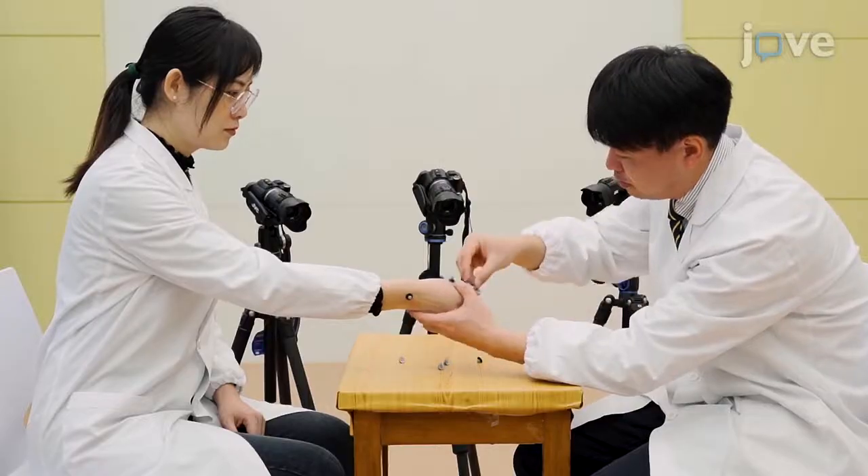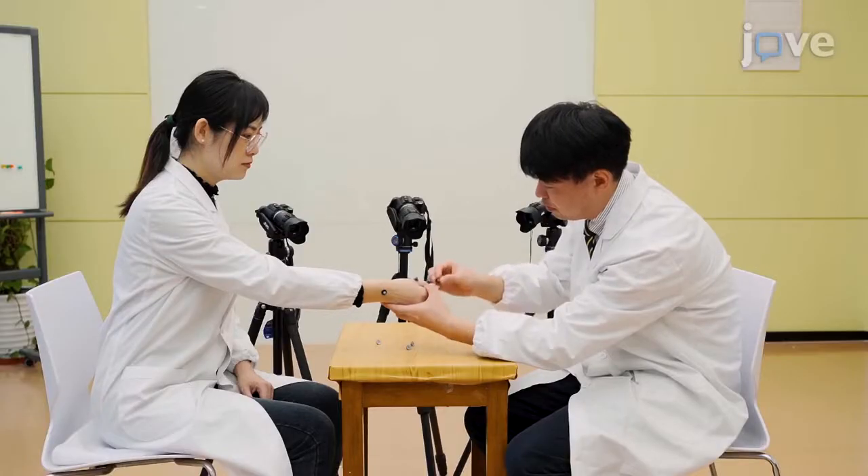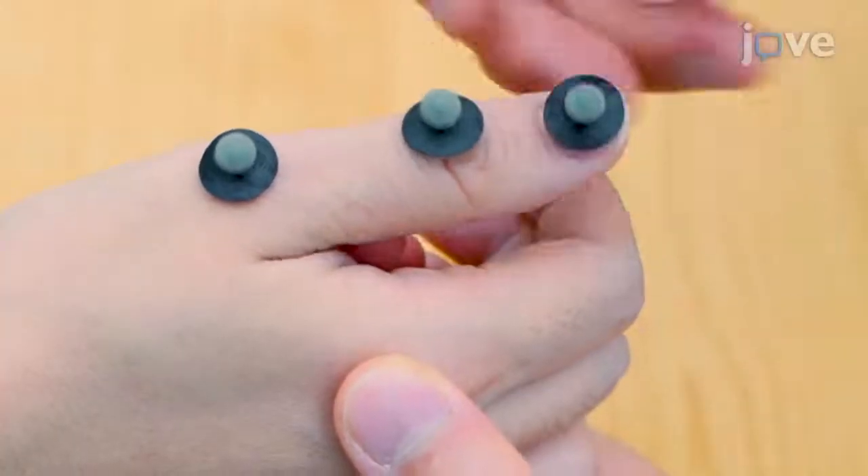Attach one ball at the interphalangeal joint, defined as tracking point: thumb end joint. Attach one ball on the center of the thumbnail, defined as tracking point: thumb tip.